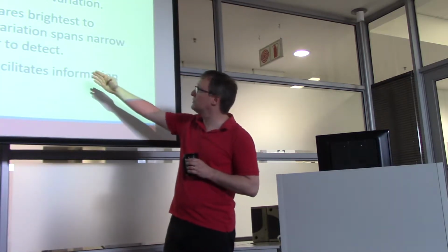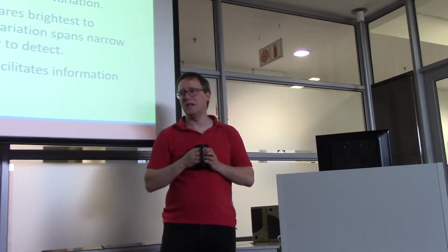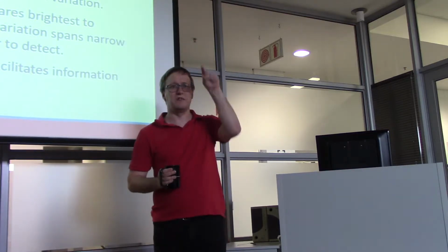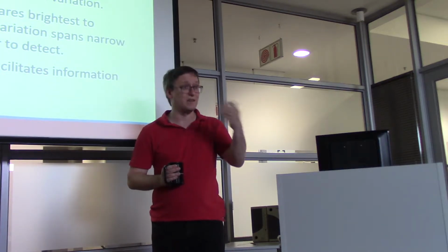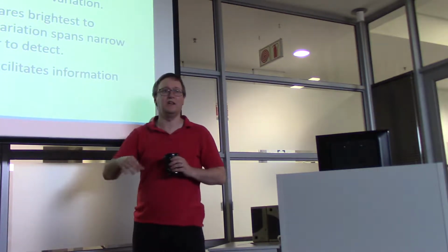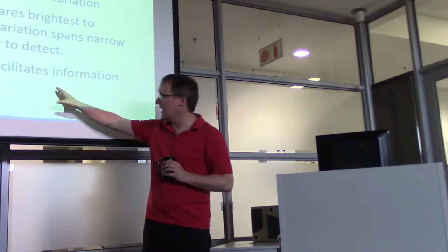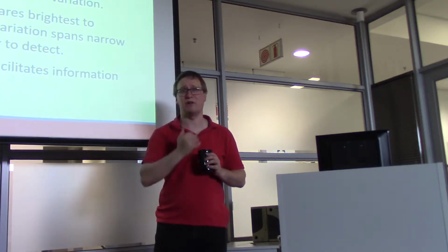So dynamic range is a comparison between the brightest and darkest return that you get from an image. If you have 16-bit brightnesses, very high resolution brightness distinctions, and you're only working within the top 4 bits, you're losing most of your ability to discriminate a high signal from a low. You don't have a lot of contrast, in other words. So having the light return from a sample be well within the range of intensities you can actually capture makes a very big difference. Optimizing contrast facilitates our ability to get information out of microscopy data.